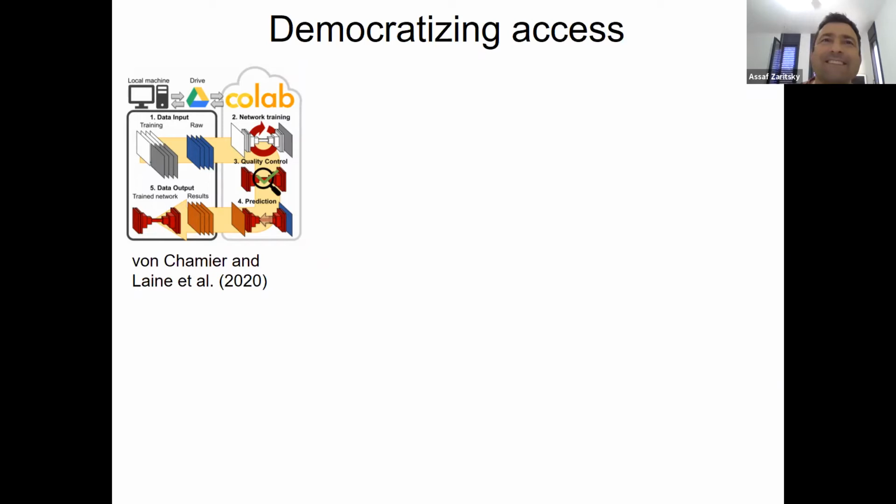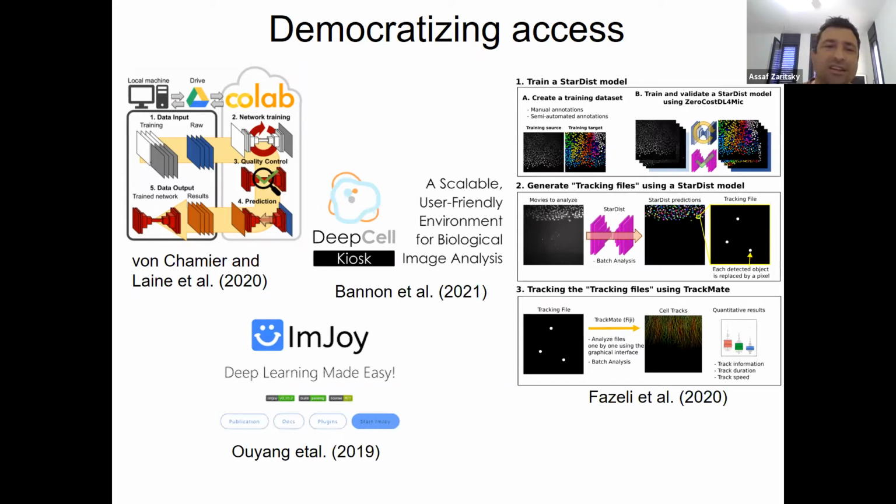Amit is frozen. Anyway, so this is an important step, and now they implemented quite a few of these pipelines, and they are not the only one. So you get more and more of these that do different aspects of deep learning to microscopy, which basically democratize it now to the wide community of cell biologists that do not need to be very skilled at using fancy computation or deep learning or machine learning, and they can use it out of the box.